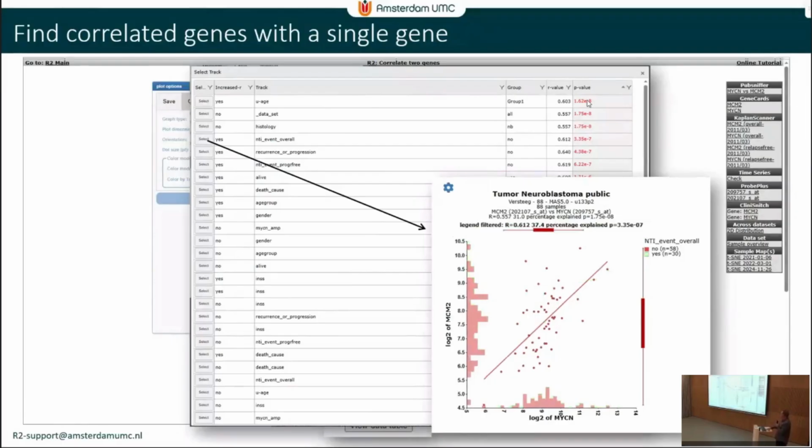And as you will maybe later on also discover, there are many of these little loops in the platform which allows you to perform such an analysis. If you ever get the idea that you want to do it, then often there's already a button for it that allows you to do it. And if you think of something cool that's not in there yet, please let us know, because this whole program has developed by getting feedback from the people that have used it. We are using it ourselves as well a lot, but especially all the feedback that we got from users helps to make things better.